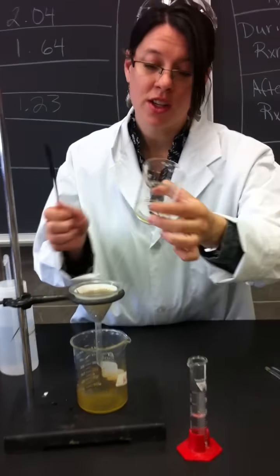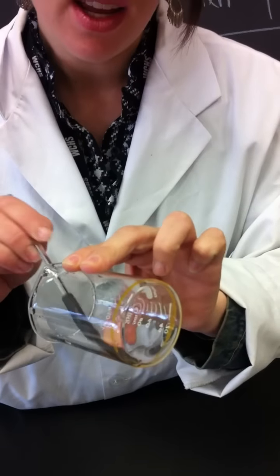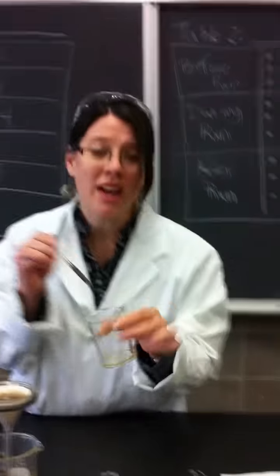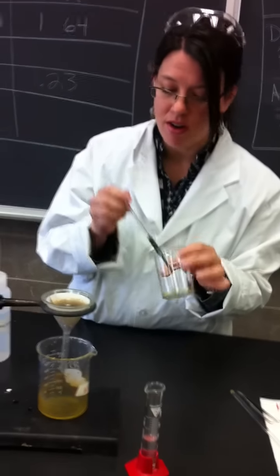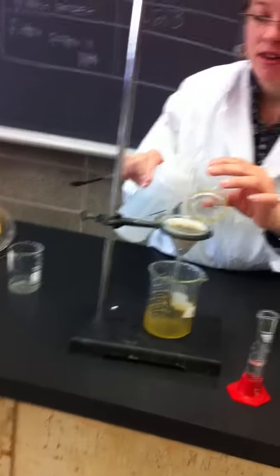Okay, now if you take a look at the beaker, you can see that there's an orange ring around it. So that's unfortunate. It's probably because we had this sitting out for the weekend. So it sat longer than yours will, because yours will just be overnight. But that's a good source of error. We've lost some precipitate on the ring here. I would have to put acid in there or something to get that off and then throw it through here. But I'm just going to take that as a source of error. Negligible source of error.